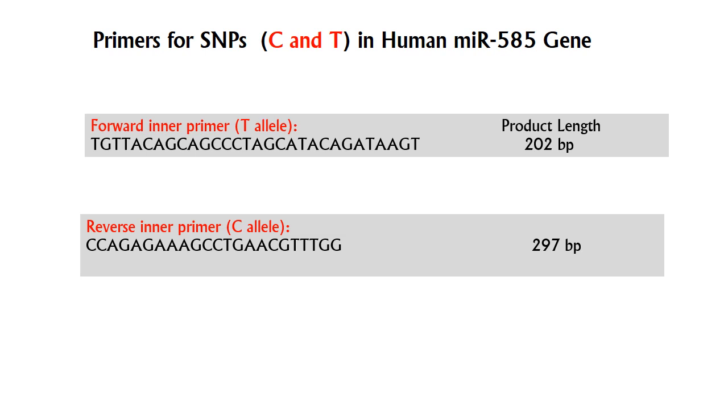If you want to design primers, then there is another process for it. We will design primers on the Primer One software, which is available online, and it is very easy to design primers. When you design primers there, then we can apply these primers for carrying out the PCR.